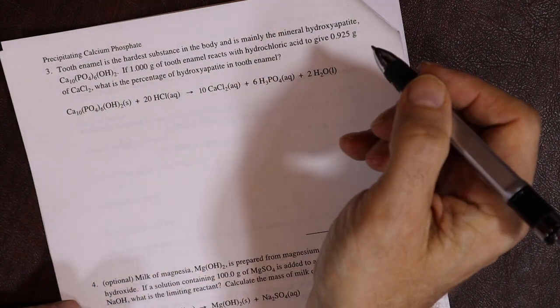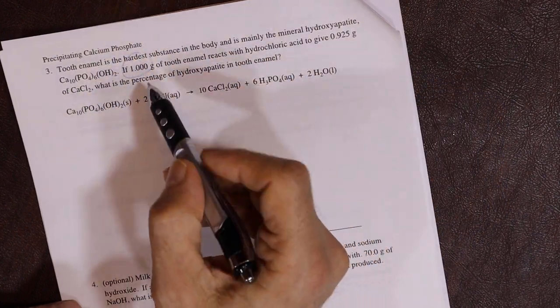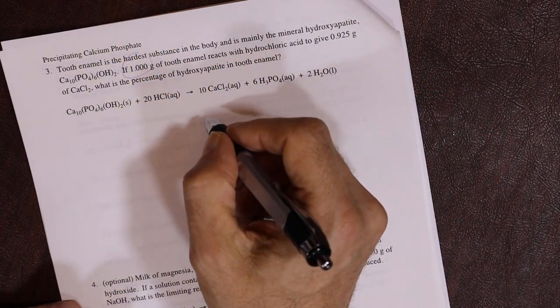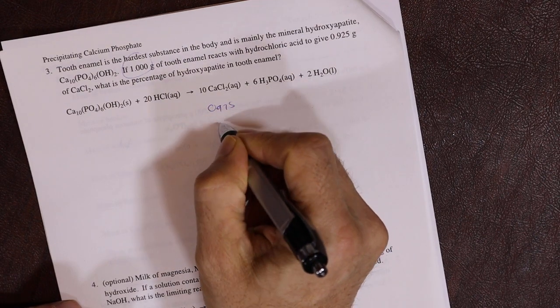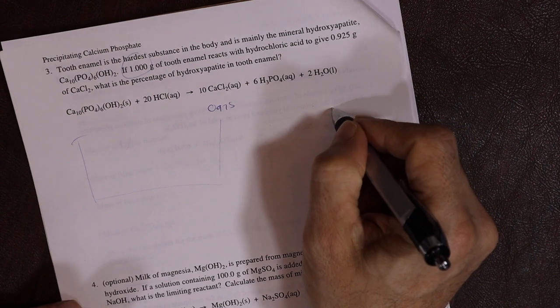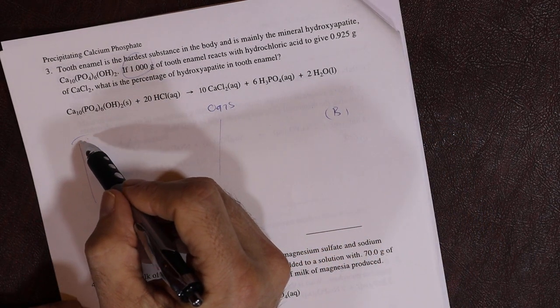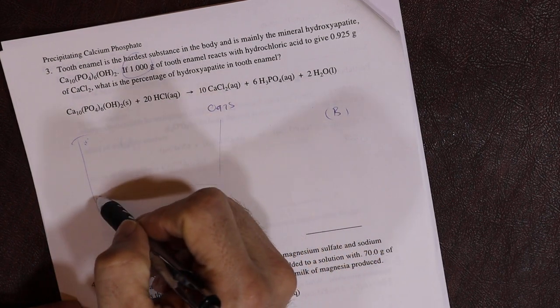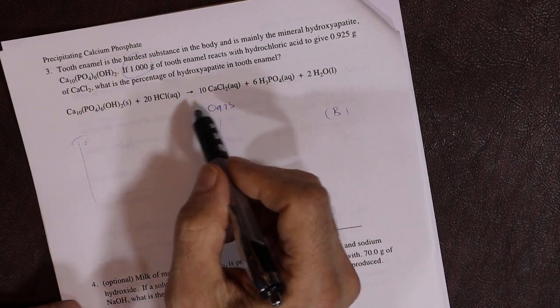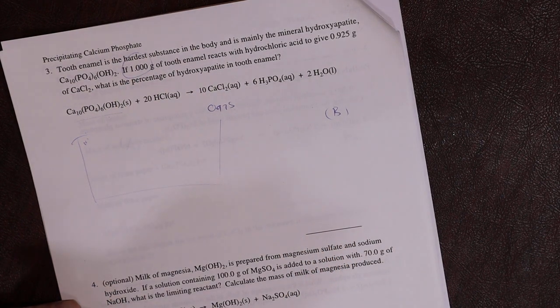So tooth enamel is a mixture. If we had 1 gram of tooth enamel and it gave us 0.925 grams of this, it's another B backwards. It's a mixture, so find out how many grams of this thing are in the tooth enamel, divide by this times 100 for a percent.